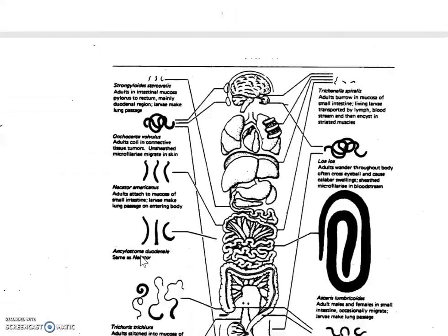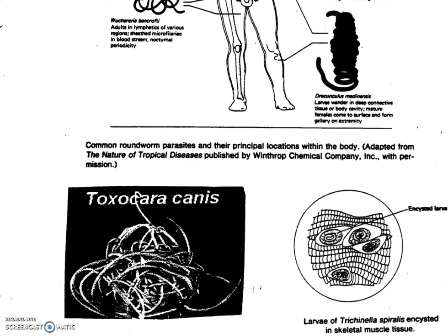And yeah, what I really wanted to show you was the encysted larva of the Trichinella spiralis. This is what they're looking for when they're inspecting meat. You're looking for these spiral kind of things that occur in infected meat. So here you have this encysted larva right here, and that is typical of Trichinella spiralis, and meat gets inspected for the presence of these spiral encysted larvae.